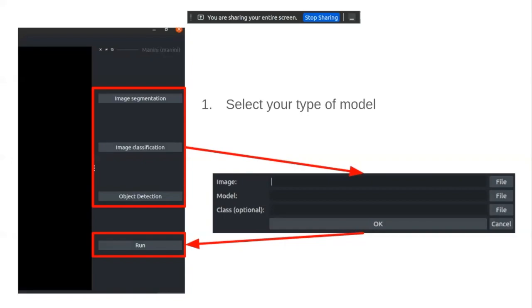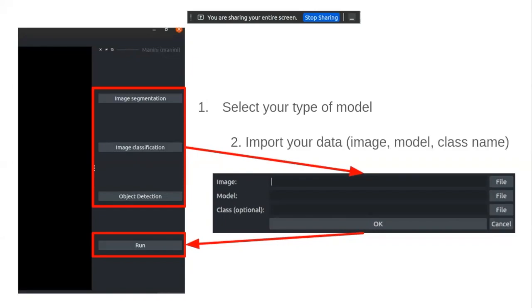When you click one of them — the image segmentation, classification, or detection tool — you will find a window to import your data. There are three types of data: image, model, or class. For the image, the plugin wants a compressed file where you store all your images. For the model, the plugin currently accepts only a Keras model in TensorFlow. The class is a text file where you specify the name of each class of your model.